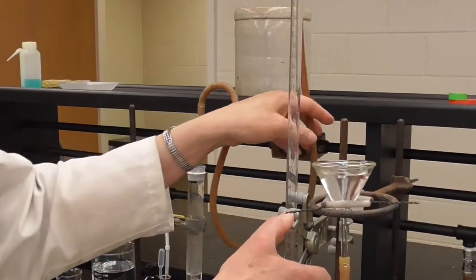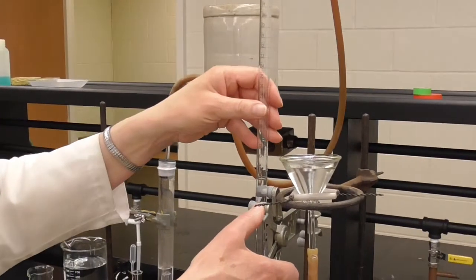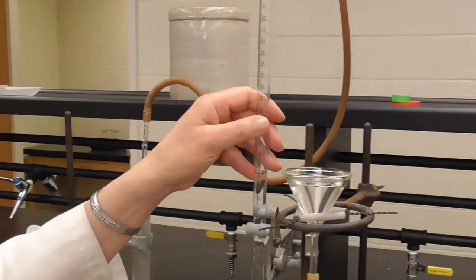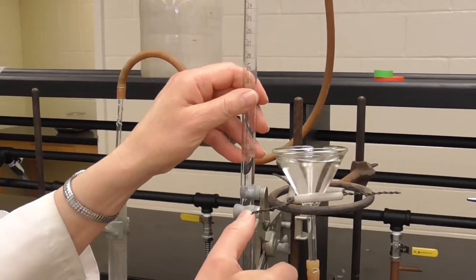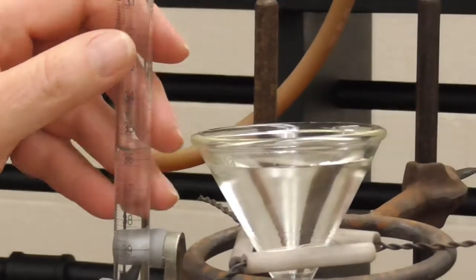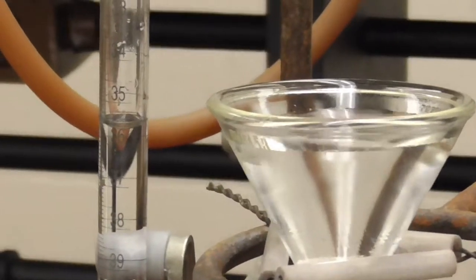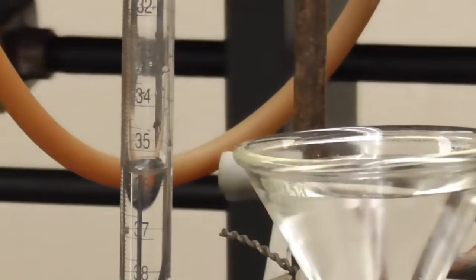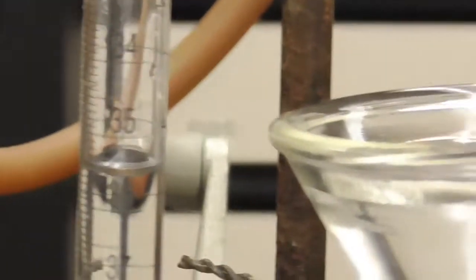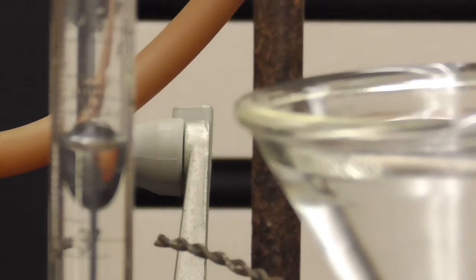I can do that in a couple of ways. It looks like this apparatus is such that I'll be able to just simply raise the burette, and then again make sure that the levels are the same at this point, again, as well as I can determine it. And so Dr. Dene will now focus in on that and show you that the levels are, as well as we can determine, equal to each other.